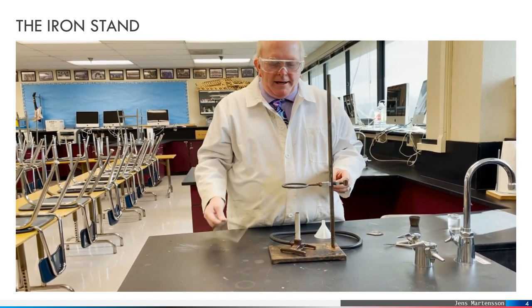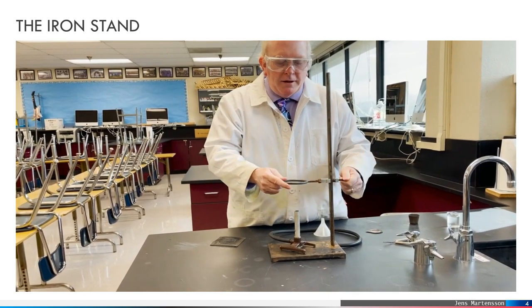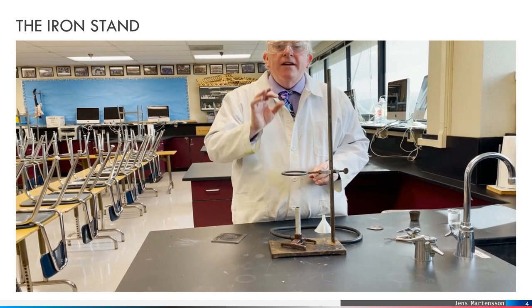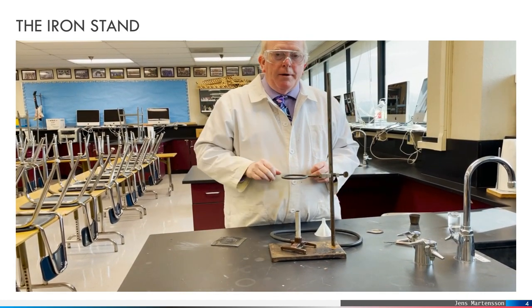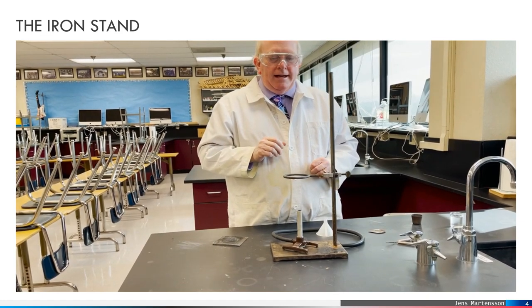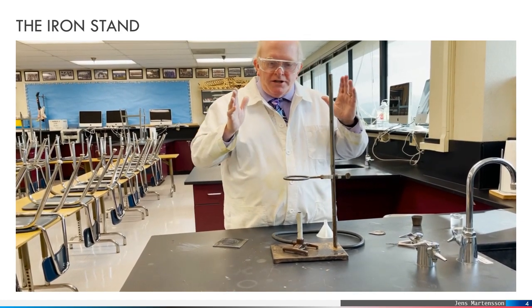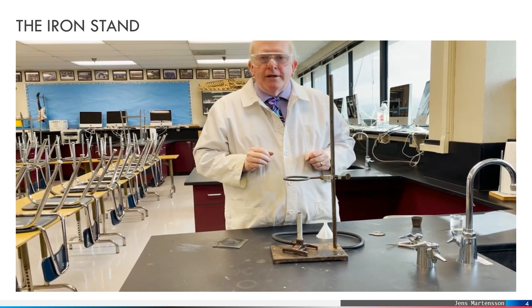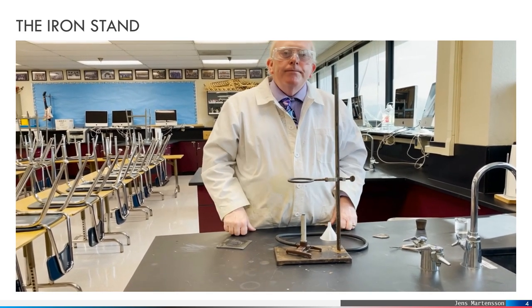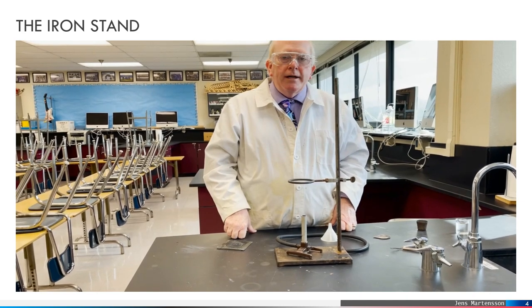Depending upon the size of your flame, you can move the ring up or down, but be very careful because these rings get very hot when the Bunsen burner is on, so do not touch them except for setup. Once you're done, leave it to cool for 10 minutes before you take it off. Okay, thanks for tuning in. This is Morgan signing off.